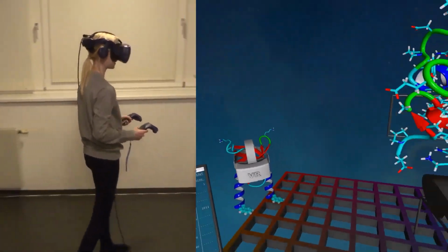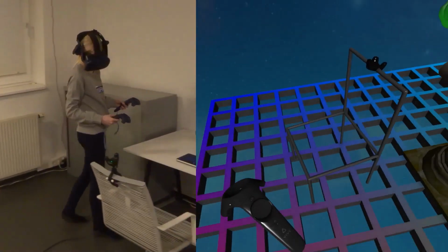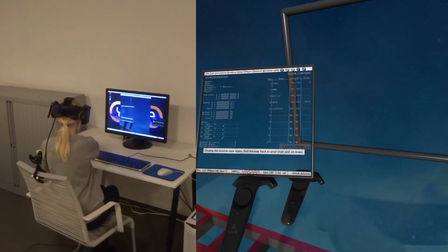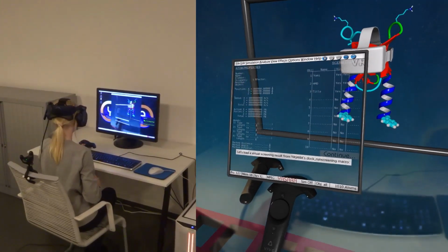This is especially easy if you are using a Vive or Index headset and bought an extra Vive tracker. To make your chair appear in the VR world, simply attach the tracker to the top of the chair as shown, for example, using a camera tripod with flexible legs.